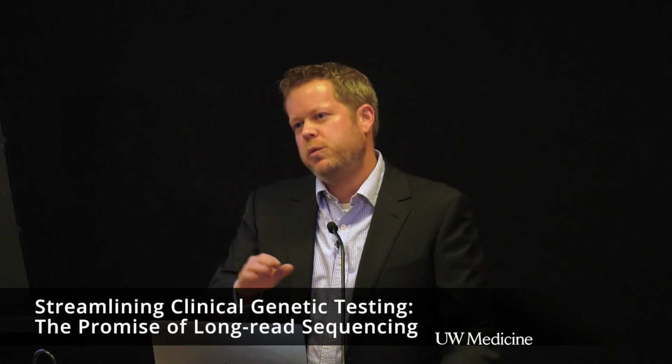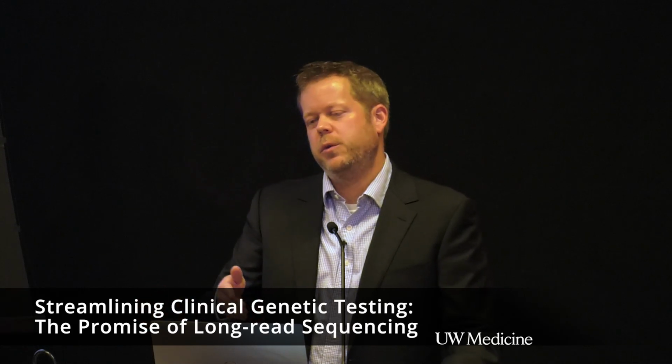Yeah. So you mentioned a possible application of the sequencing to non-invasive prenatal testing, and you said one possible advantage is the shorter turnaround time. For standard non-invasive prenatal testing, of course, one of the limitations is low fetal fractions. Do you anticipate being able to use the sequencing earlier in pregnancy? That's an excellent question. So how early could you use long reads in NIPT, and does the fetal fraction affect that? I have to be honest, I don't know, but that's one question that we have as we're thinking about how to design those experiments. Like, what does it look like at 9, 12? Pick your weeks, right? And then ask, what can we actually see? Could we go earlier if we get things like methylation, right? Is there a methylation signal that we can pick up and get a better sense of what that fraction is? I don't know, but it's going to be part of that evaluation, and it's an excellent question.